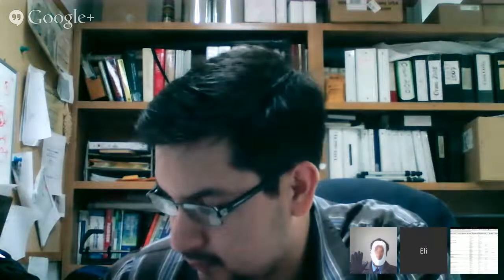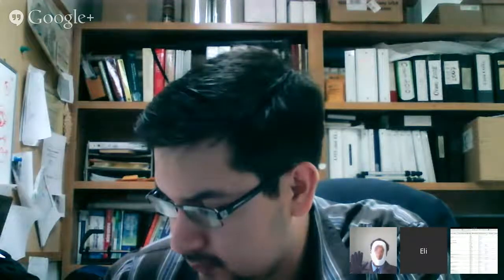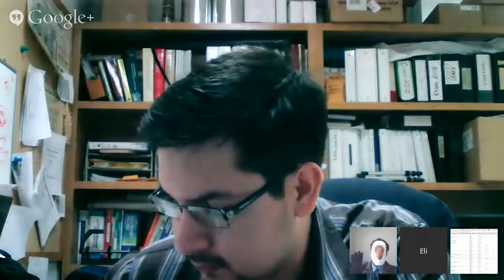So, can you see my terminal now? Yes. Okay, good. So here, I guess first I should show you. So y'all are working with corn, right? And so the first thing I did is I need to get a reference genome, because y'all are interested now in applying your sequencing samples to the full genome. Is that correct? Yes. Okay.